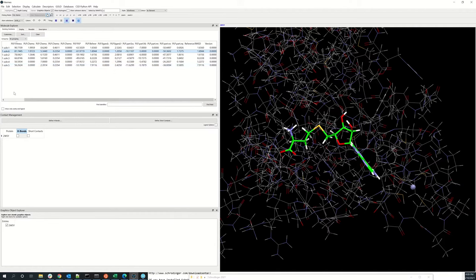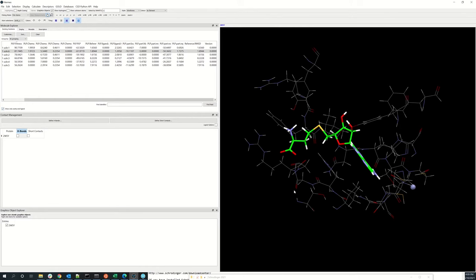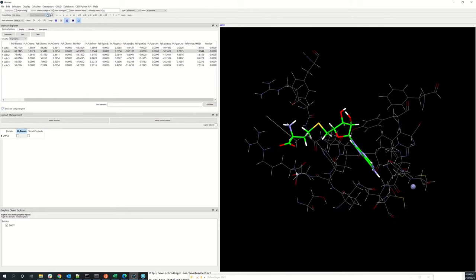You can also click on show only cavity and ligand, and this will display the binding site only.